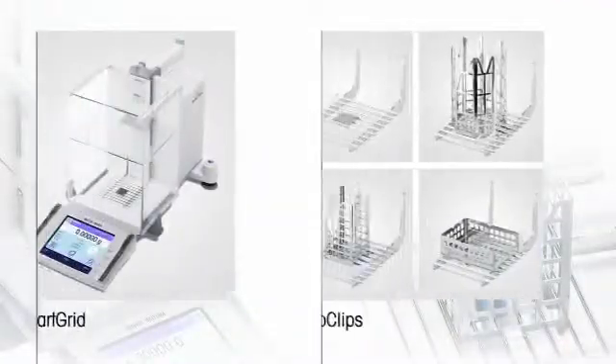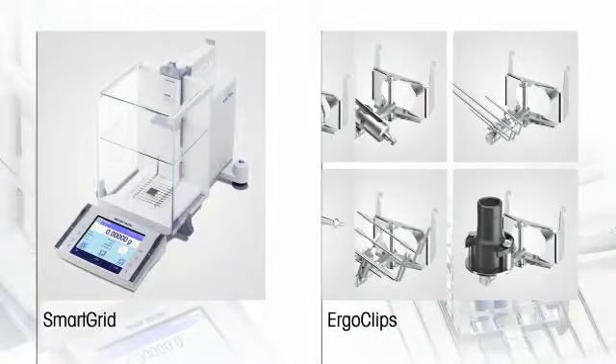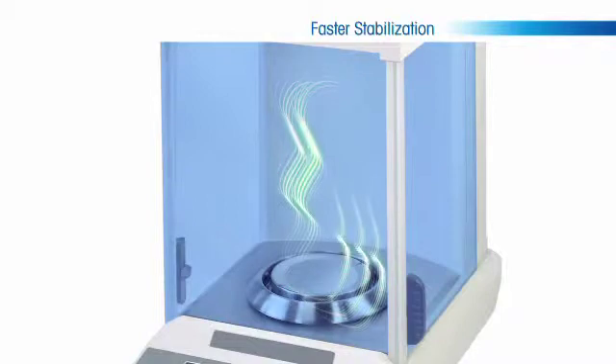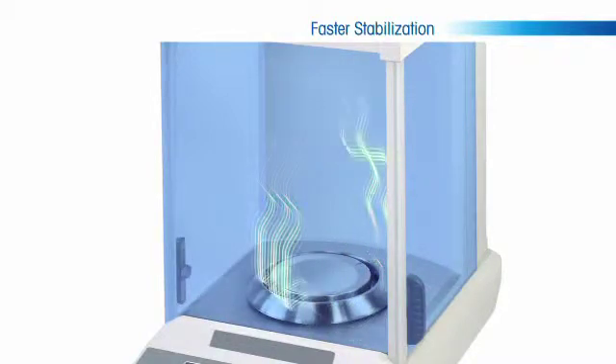Exploring these features more closely, Mettler Toledo is pleased to showcase its innovative smart grid weigh pan and abundant line of ErgoClips. When the doors shut on an analytical balance, there is a natural flow of air that becomes trapped and circulated through the weigh chamber.